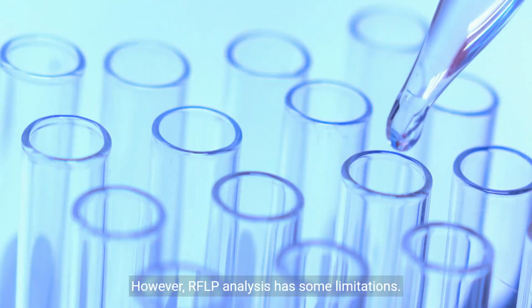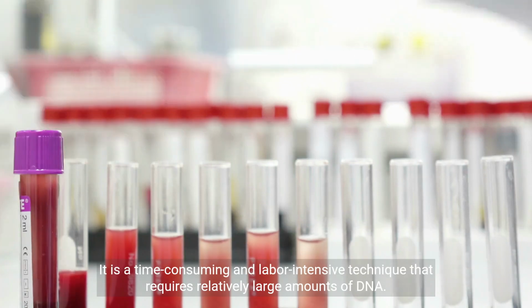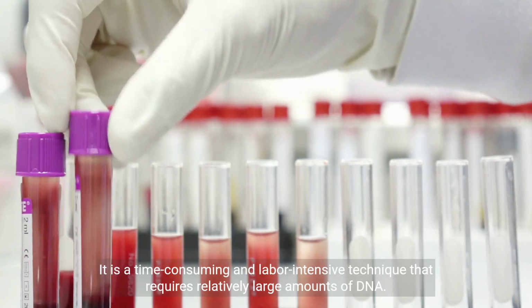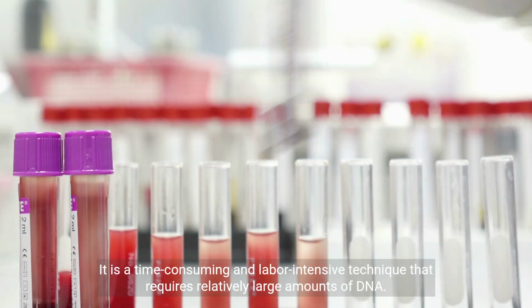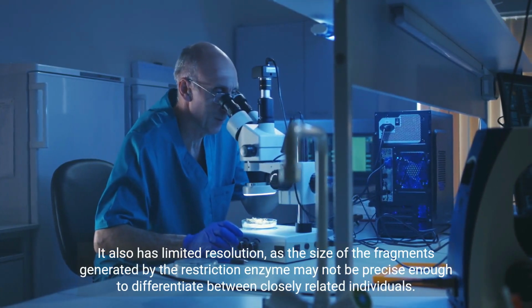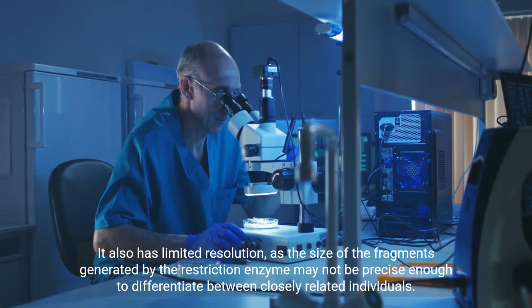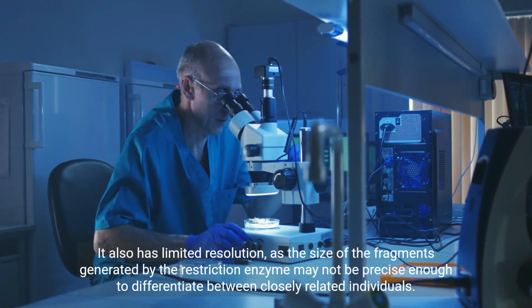However, RFLP analysis has some limitations. It is a time-consuming and labor-intensive technique that requires relatively large amounts of DNA. It also has limited resolution, as the size of the fragments generated by the restriction enzyme may not be precise enough to differentiate between closely related individuals.